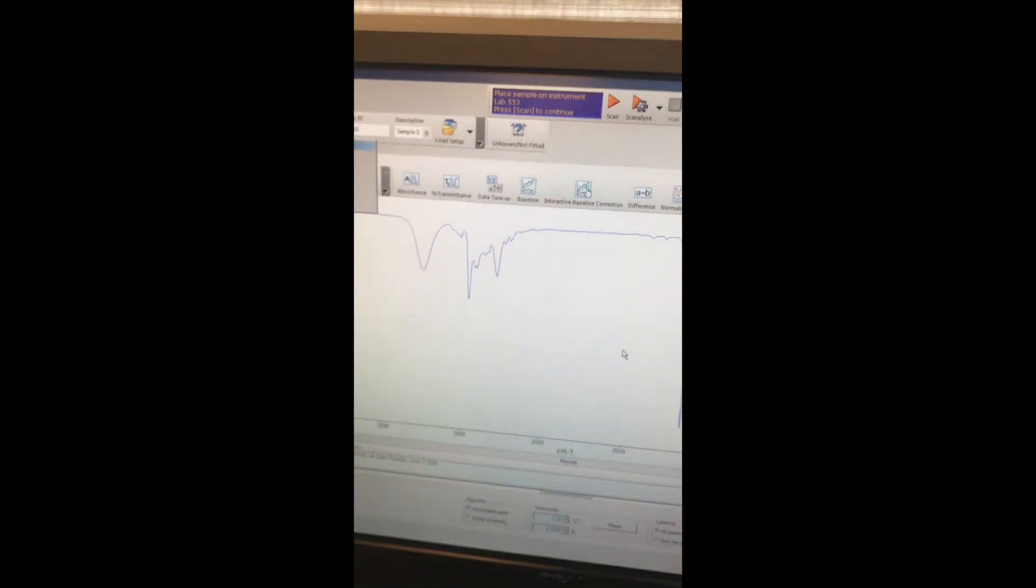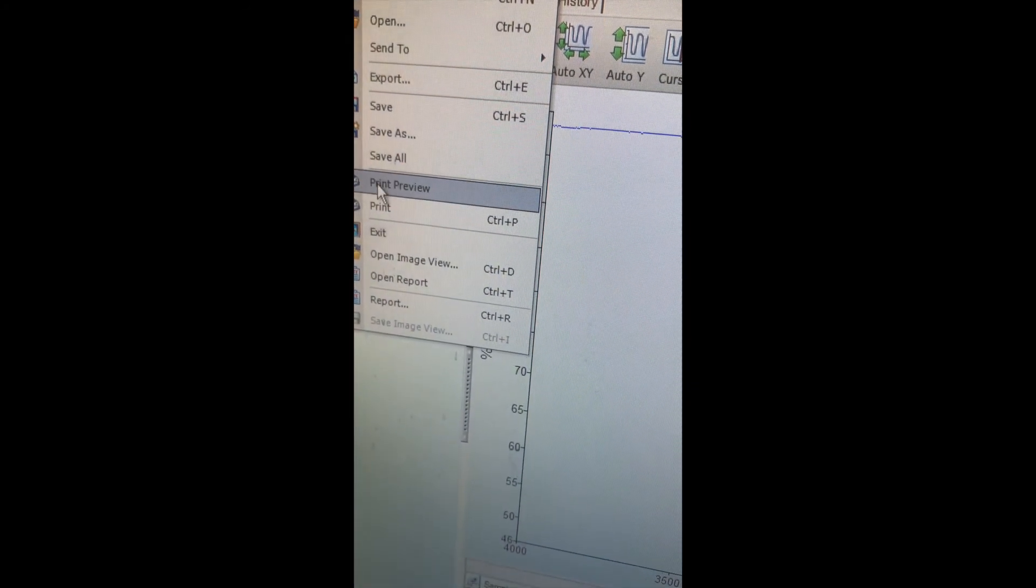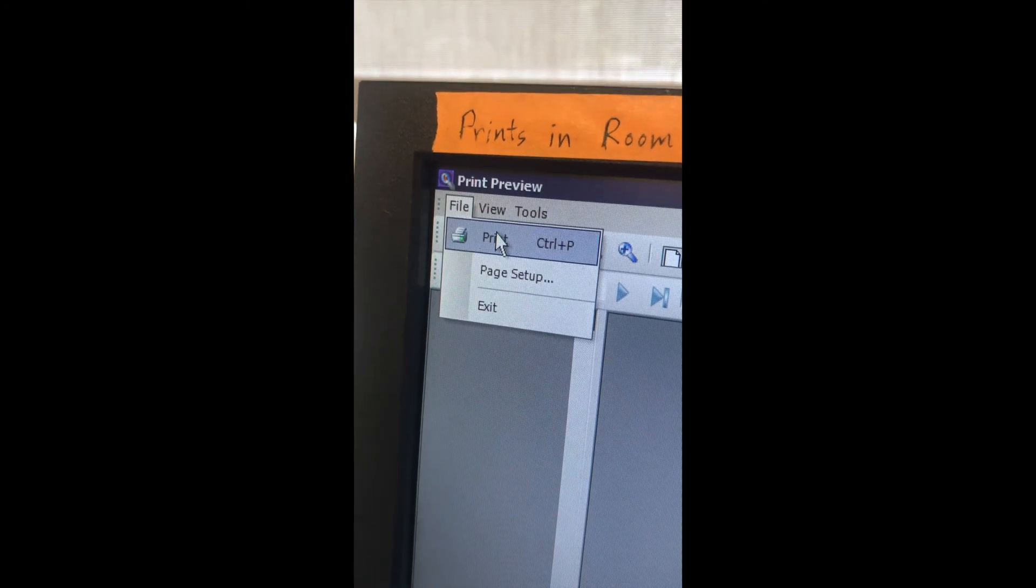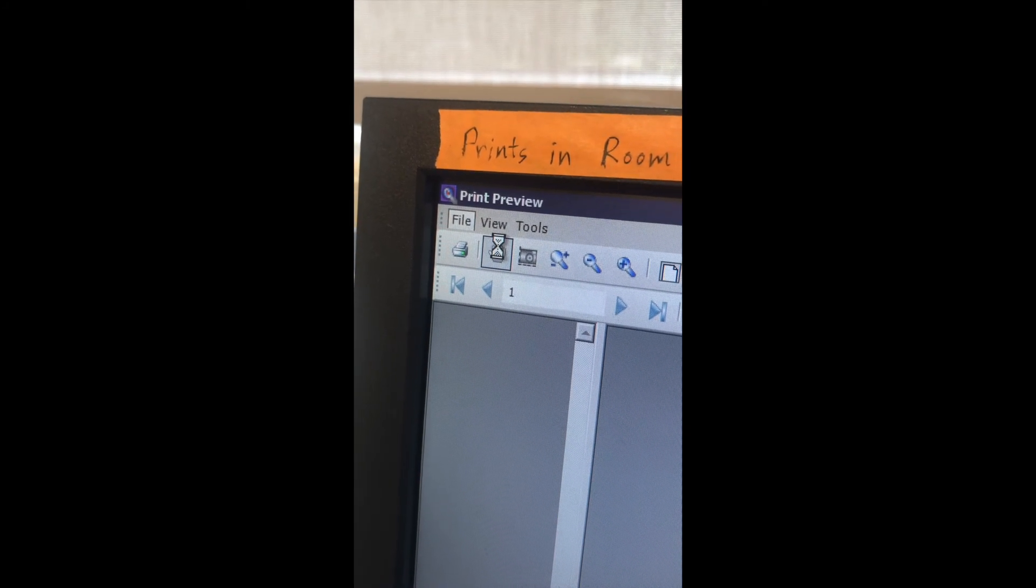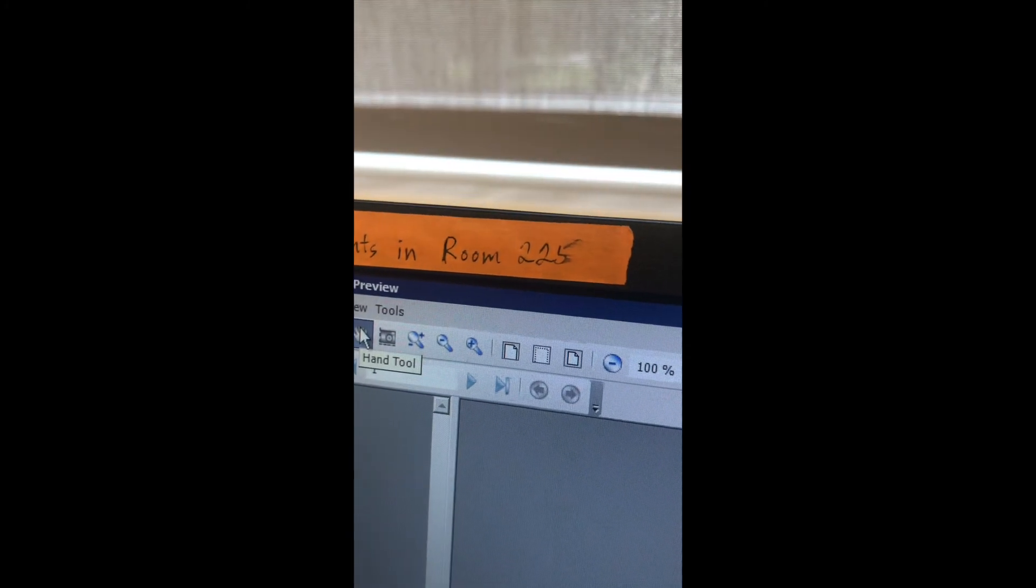Once our scan is complete, we'll have to print that. So you go to File, Print Preview, and a preview of your spectrum will show up on the screen. And once we verify that that is the one that we want to print, in fact, we can go over to File, and we'll do File, Print, and that'll be all set there. And then notice here, the piece of tape, it prints in room 225, so you've got to run across the hall and pick up your printer.